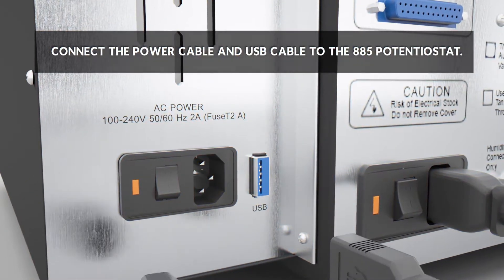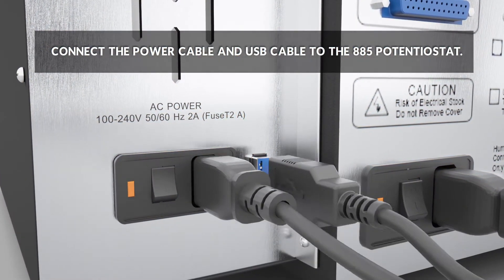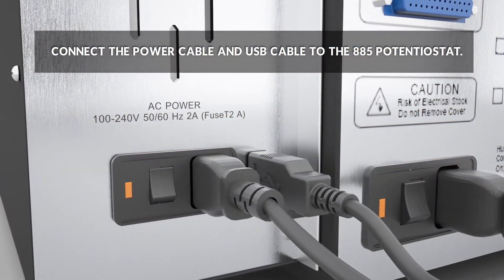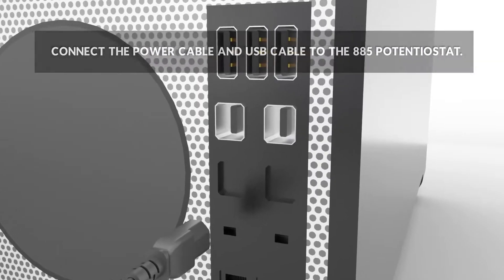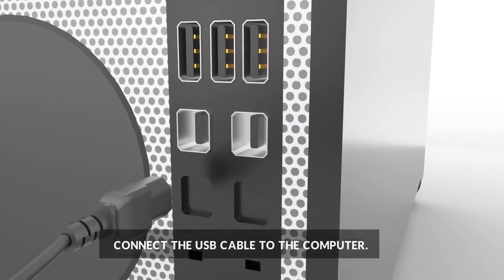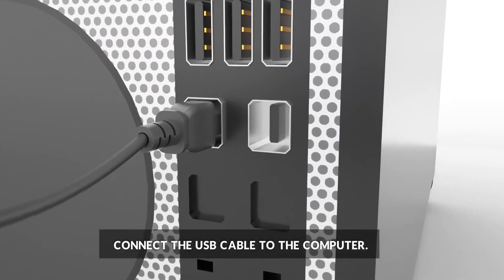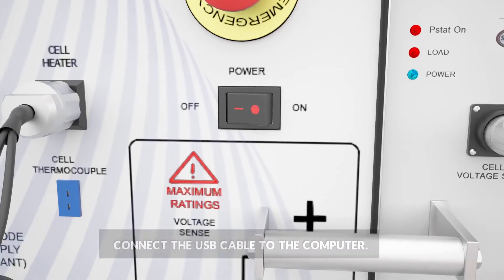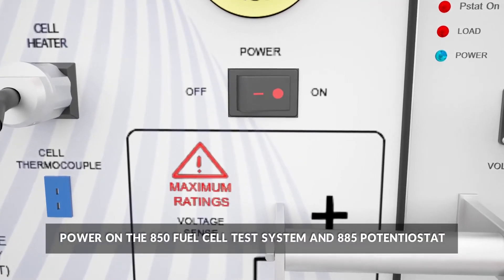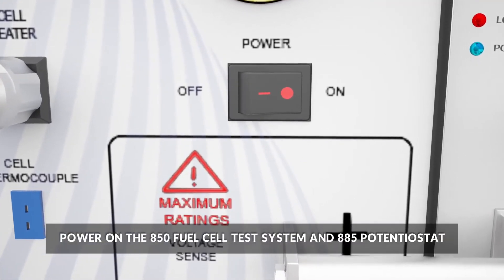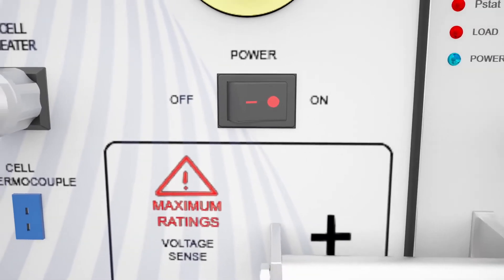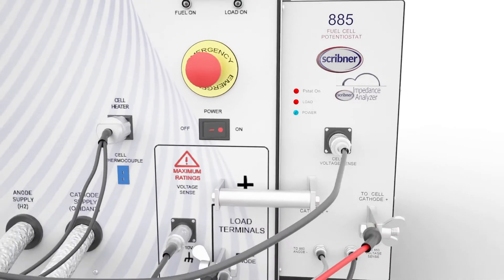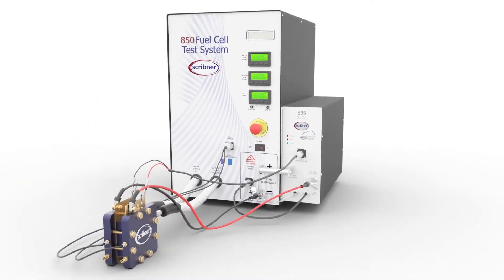Connect the power cable and USB cable to the 885. Connect the USB cable to the computer. Power on the 850 fuel cell test system and 885. The fuel cell software will automatically recognize that the 885 is installed as part of the test system.